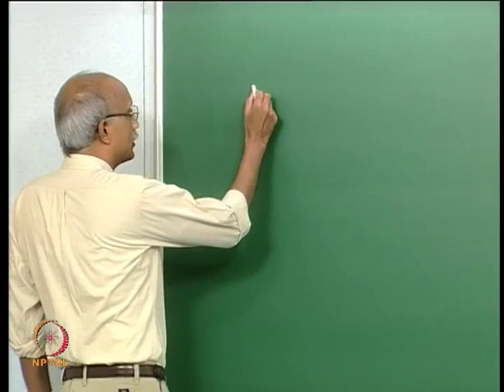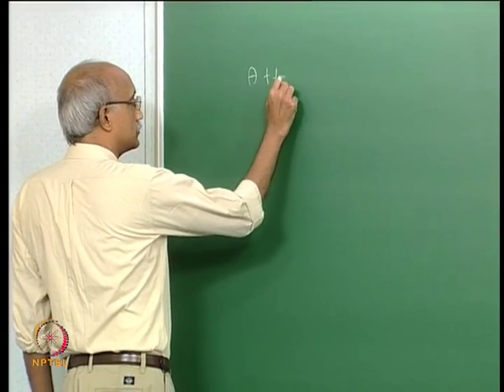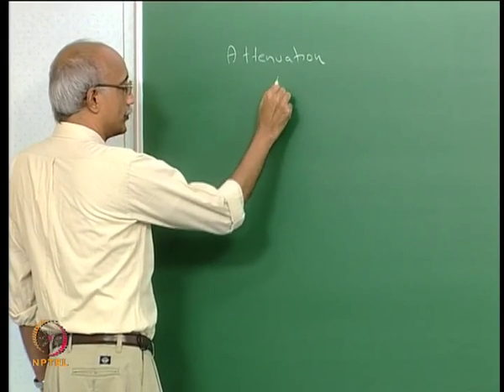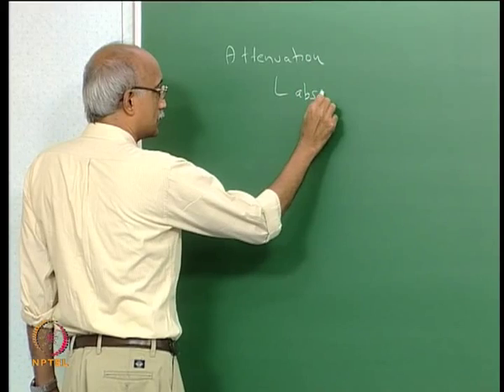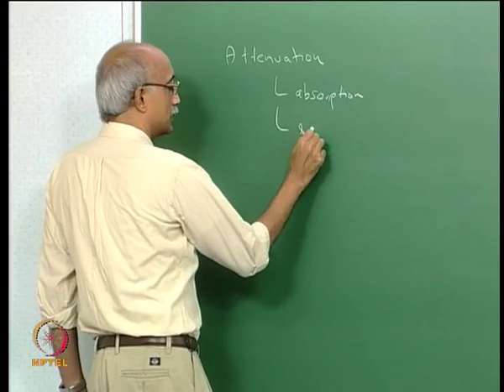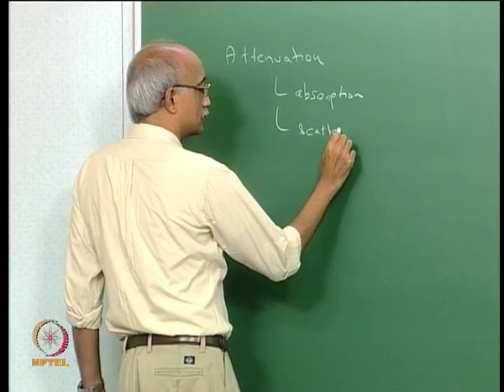So, when we talk about attenuation, there are two components to it. One is absorption and the other is scattering.